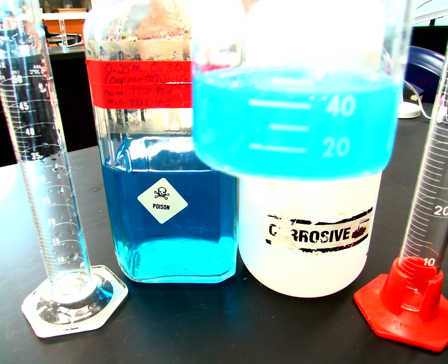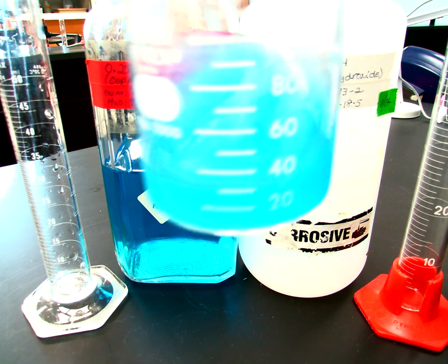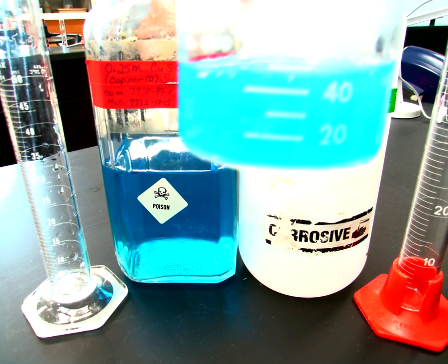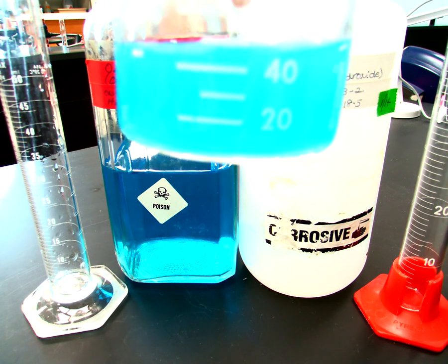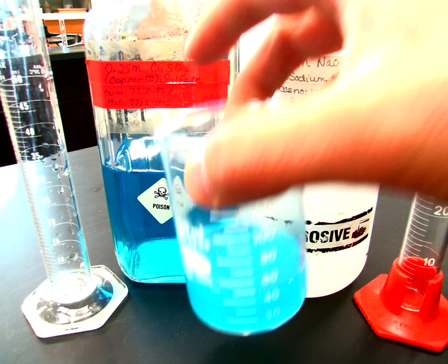So there is a solid blue precipitate in this beaker, and after a while it will settle out, and you should know how to separate the solid out of this because we learned how to do that before. Again, the point is to find the percent yield of the cupric hydroxide from the reaction.